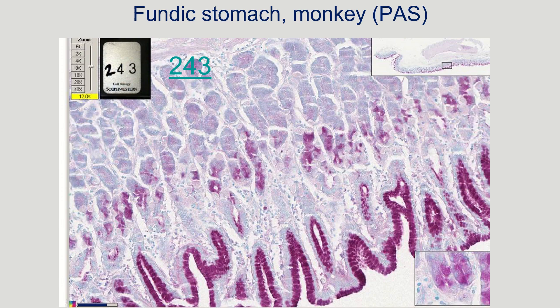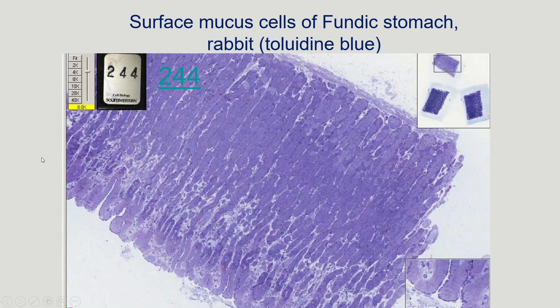This is again the fundic stomach, now in a PAS stain — a little more zoomed in. The PAS stain is highlighting the carbohydrate-rich places, including all the mucous membranes throughout the fundic stomach. Finally, this is the fundic stomach of a rabbit in toluidine blue — everything is blue, but you can see varying intensities of blue and some granularity, and that's how you differentiate things in a toluidine blue stain.